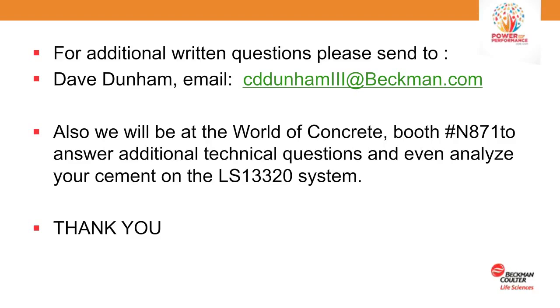Okay, that's great. We have another viewer who asks, could the tornado overcome the effects of trace amounts of liquid in the dry powder samples of having particles stick together, such as oil or water vapor? Part of that's going to be dictated by how much water vapor we might have. And what I mean by that is obviously you'd like it dry, but definitely a few percent moisture can be present, and it can disperse that.